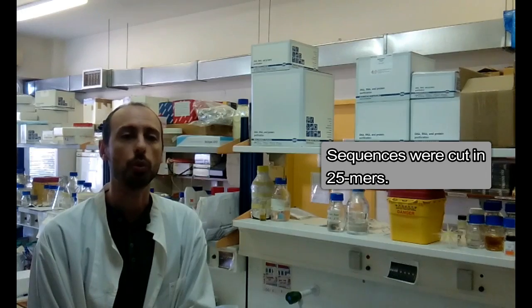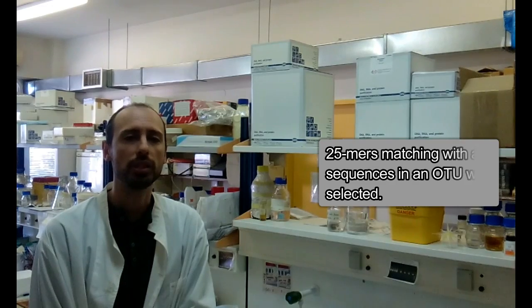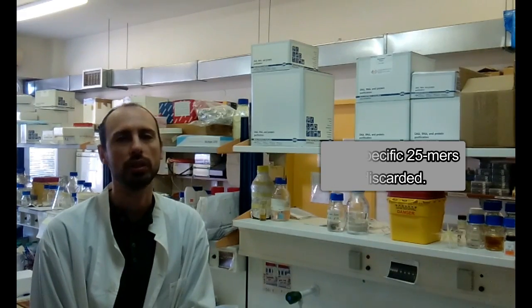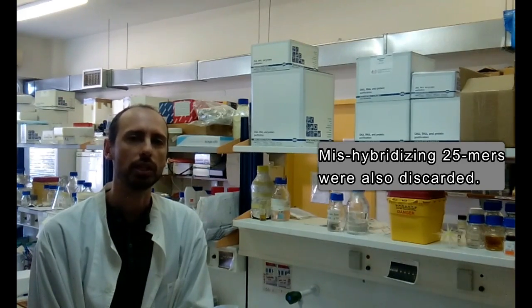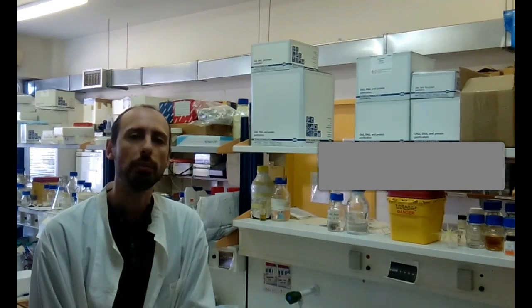Each sequence in a cluster was cut into overlapping 25-mers. The resulting 25-mers and the sequences in the cluster were then submitted to multiple alignments. The 25-mers that were aligned with all the members of a cluster were selected, while the ones that failed to align with even one member of the cluster were discarded. From this subset, the 25-mers that mishybridized with sequences from more than one cluster were also removed. The mishybridizing 25-mers contained a central 17-mer that could be found in sequences from 2 or more different clusters.